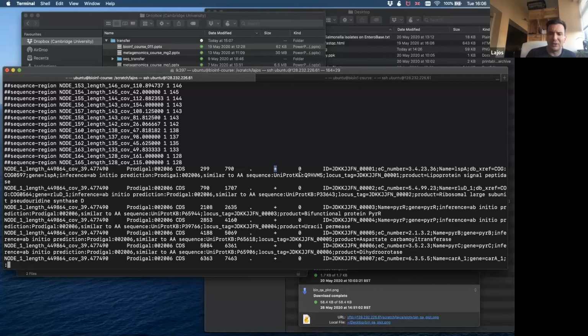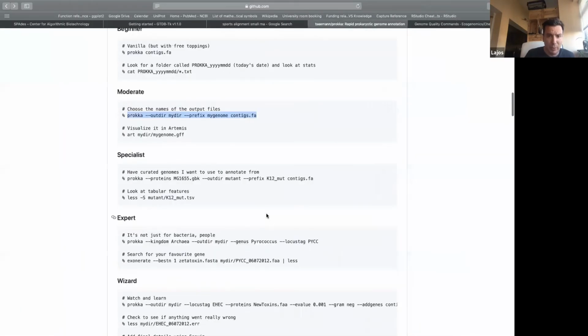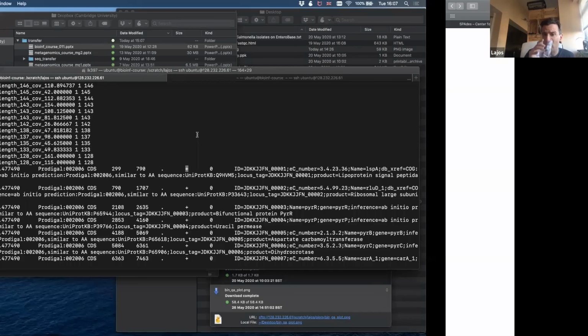And starting with the 0 frame, I think we can see all the meanings of these columns. The GFF format is a very well-known file format. I think Artemis is working with GFF as well, as far as I saw here. So if you are visualizing in Artemis, it will read in the GFF as well.